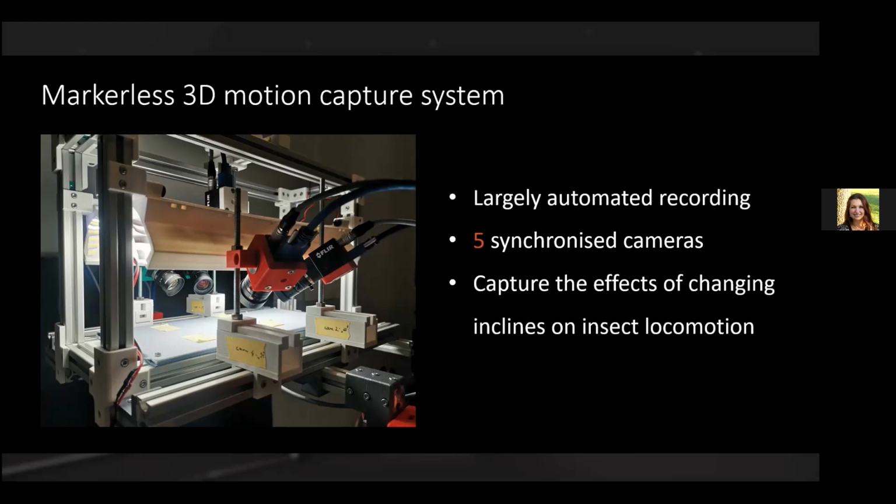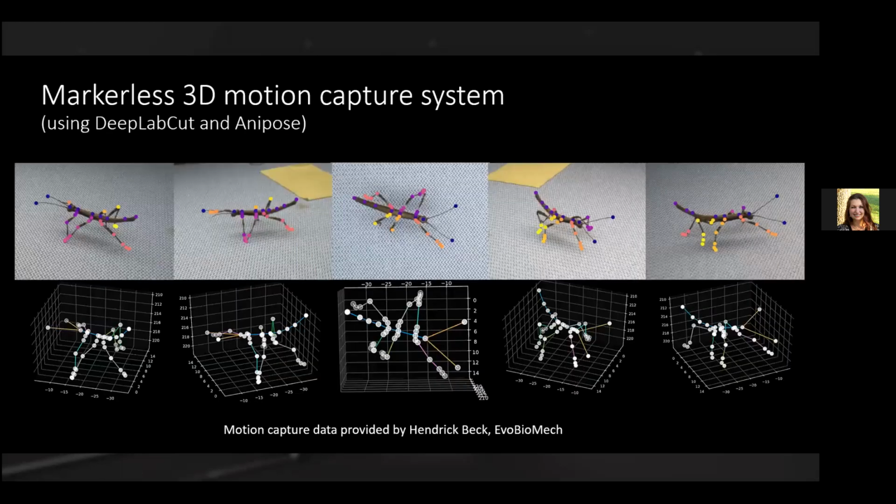But first and foremost, at least for this purpose here, what we can now do is move away from just having this in a 2D setup and bring it back to our 3D models. And this works in a couple of different steps here. The first one being, you might have heard about DeepLabCut, a great software to do so-called 2D pose estimation without any markers.